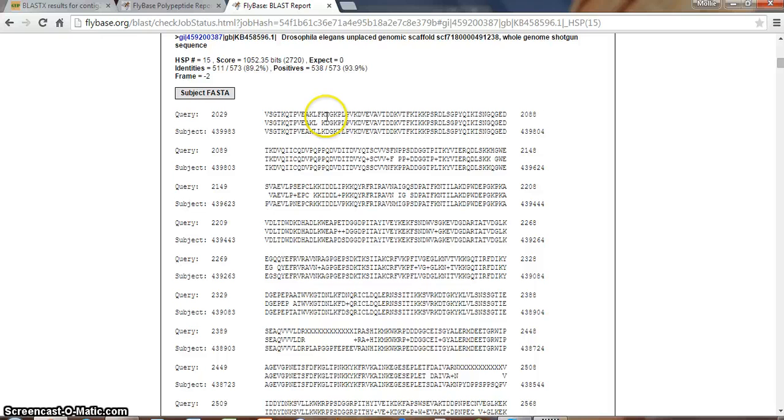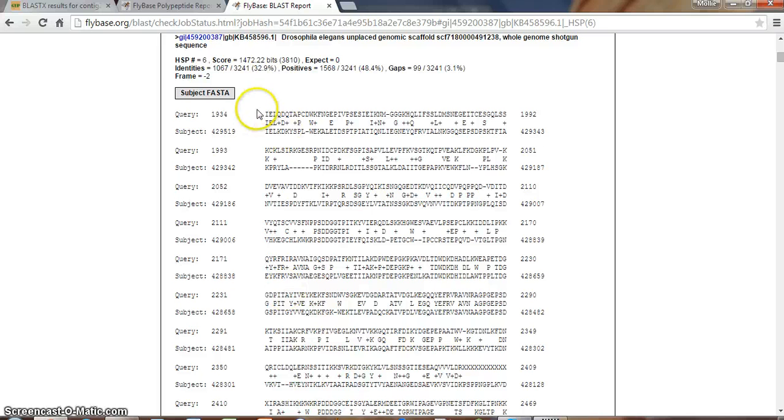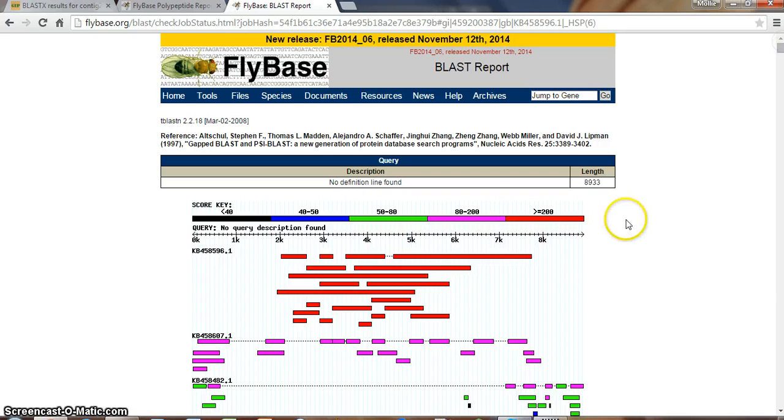Okay. These are kind of looking like they're all over the place, so that's good to know. That's the front end. Let me just check this one too. That's 429, so that's the same place as the last red one, which was 439983. Okay, that's consistent.